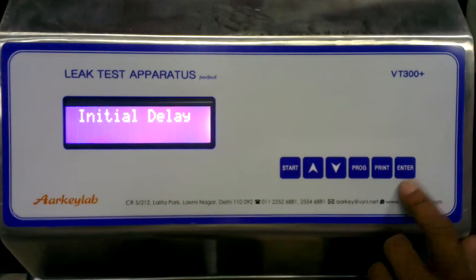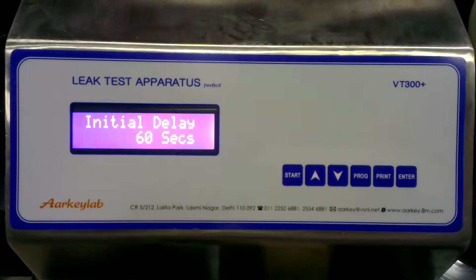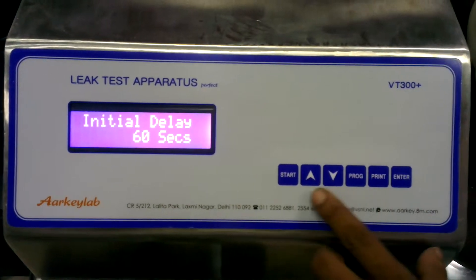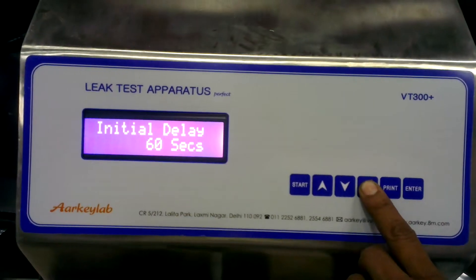With the Down/Up key, set the initial delay time to 60 seconds, then press Enter. Press Program.